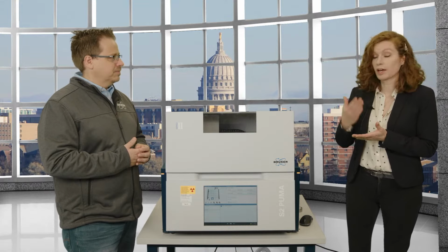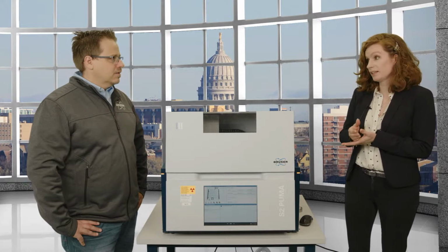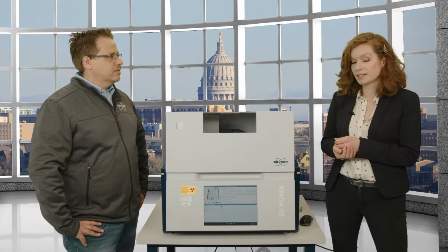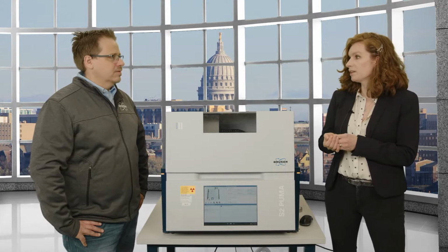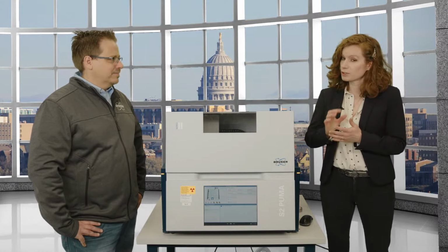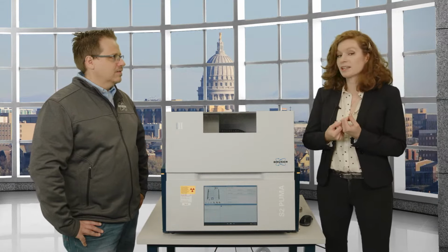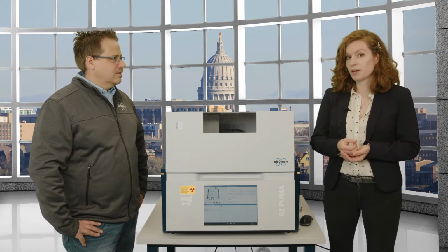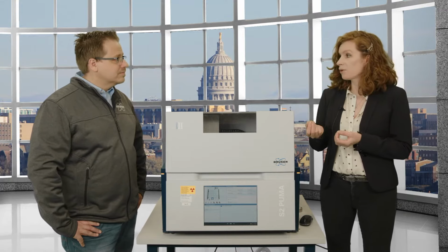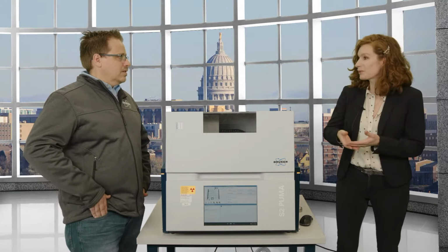It has better resolution, has higher power, and it's very good for these routine operations if you want to get something quickly. On the other hand, what EDXRF cannot do, WD with the higher power can measure: light elements, by which I mean fluorine, carbon, even down to beryllium. EDXRF is starting to scratch at those levels and we can detect them, but quantification is still hard because you need very good standards. You need a very good idea of what else is there, because in EDXRF you have a lot of overlaps of these lines that we just talked about with the Bohr model.